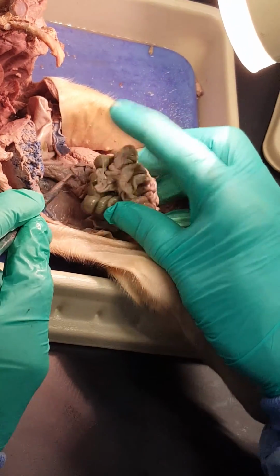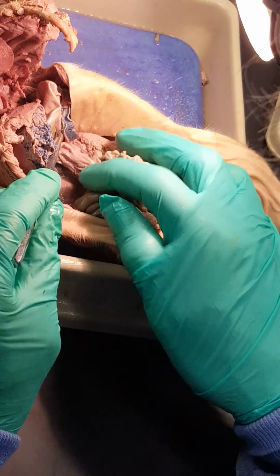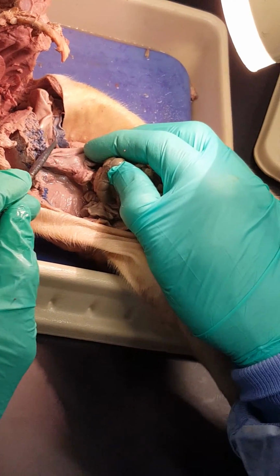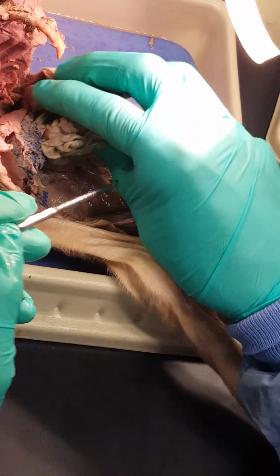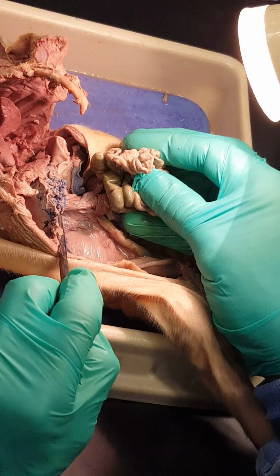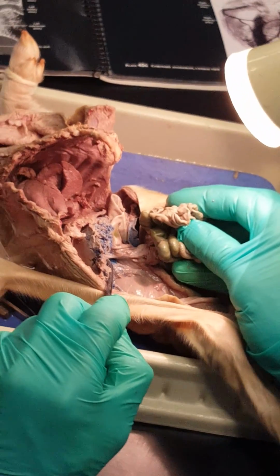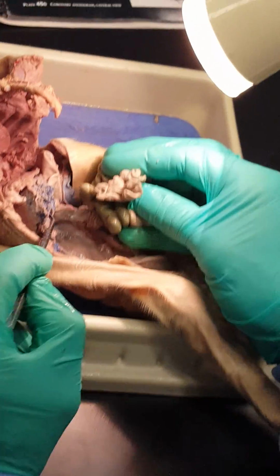Okay? So the veins from the stomach and the intestines all go to the liver, and then the liver returns it back to the... Right. Okay. So all the foodstuffs you absorb, except for lipids, have to come back through the liver. And so this is probably the hepatic portal vein. It's rarely injected in these pigs unless you pay extra. Because it's part of a portal system.